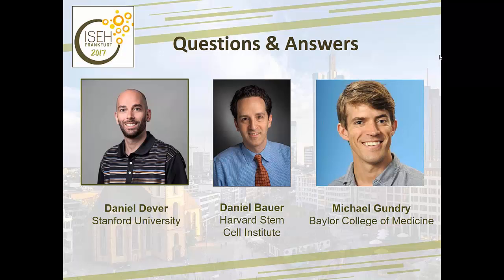So this is really a key consideration, because if it's a large library, let's say one of the genome-wide libraries with 6 guides per gene, it might be over 100,000 guides in the library, and if you want to represent each guide in 1,000 cells, it might be over 100 million cells that at minimum need to be maintained throughout the experiment. And so in part, the representation addresses a number of issues.